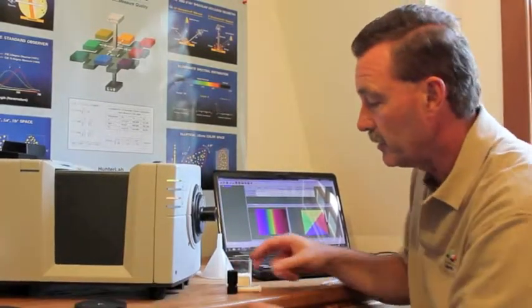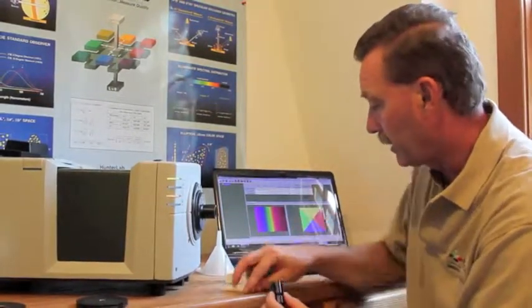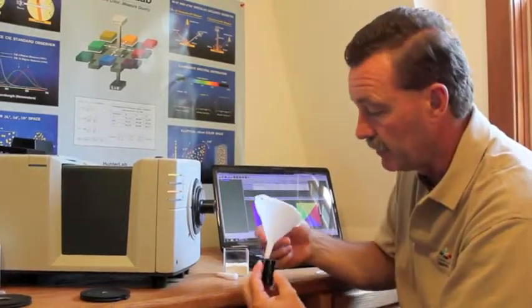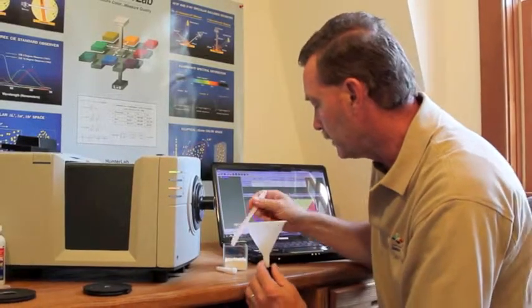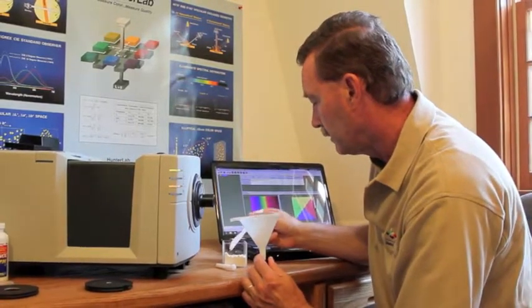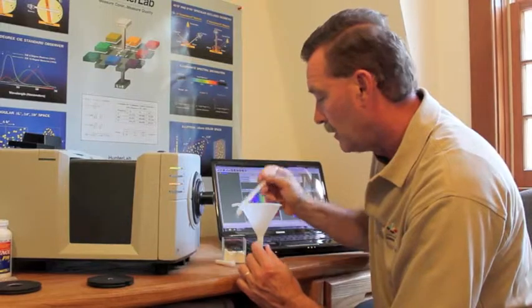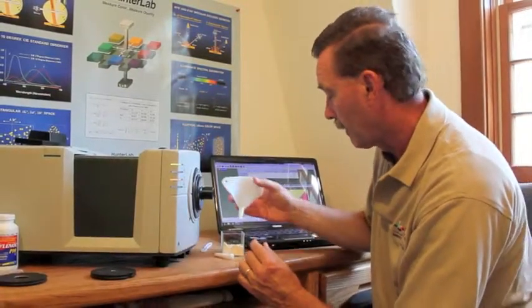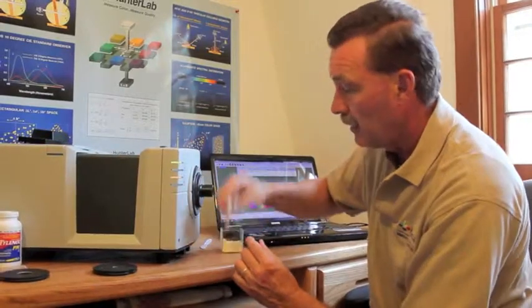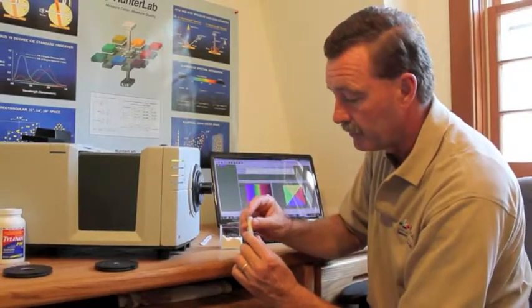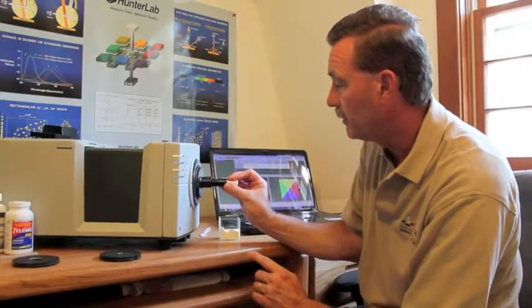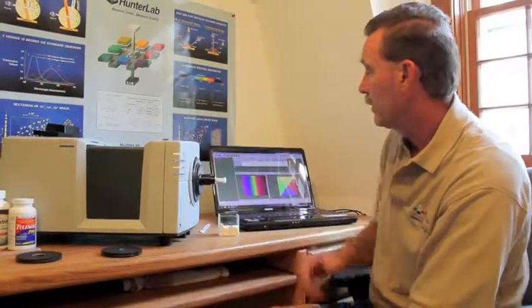Now to take a measurement, I'll take my product, and I'm going to fill my powder holder with a very small quantity, much less than one cc. Put our small volume powder in here and back it with the plunger, and what we see here now is our white area. Place it in the holder and take a reading.